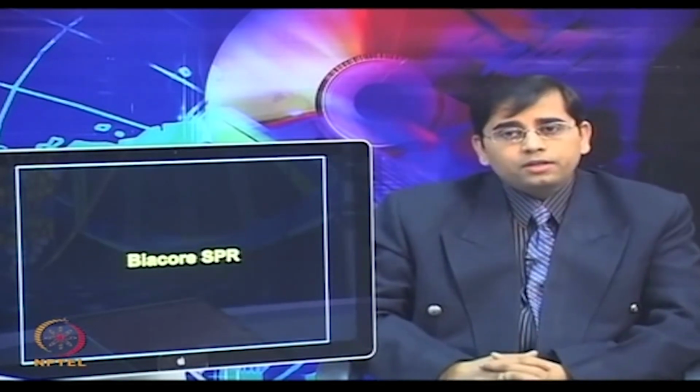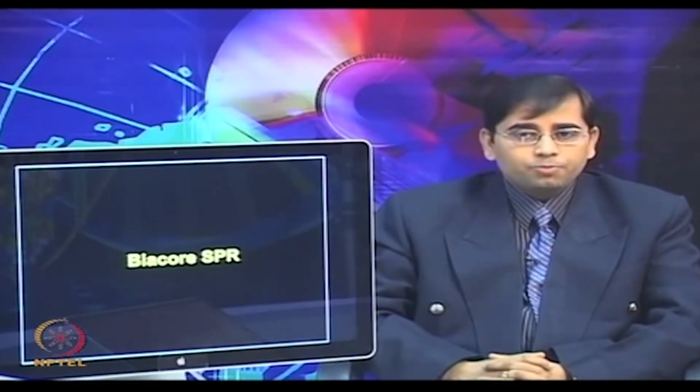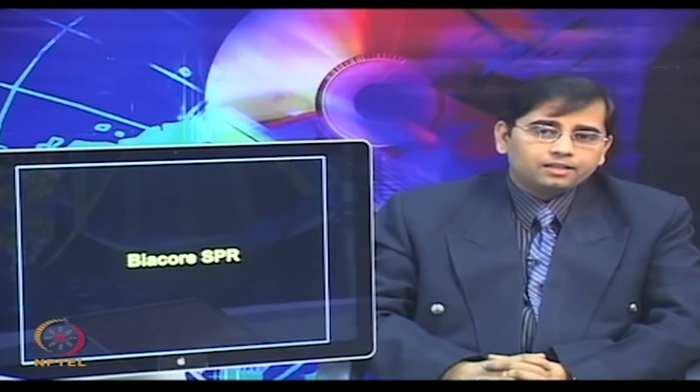So, let us now discuss the Biacore technology with Lalit Kishore, the business leader research products in GE Healthcare Life Sciences, who handles the Biacore system. Hello. Hi. It is a pleasure to introduce Mr. Lalit Kishore from GE Healthcare to discuss Biacore surface plasmon resonance technology. Lalit Kishore is business leader research products in GE Life Sciences, and today we will discuss the surface plasmon resonance technology and its various applications in proteomics. So, Lalit, welcome to the discussion on SPR technology.